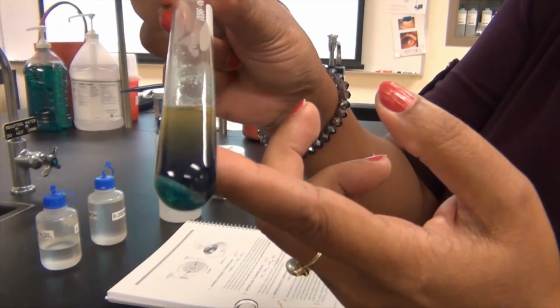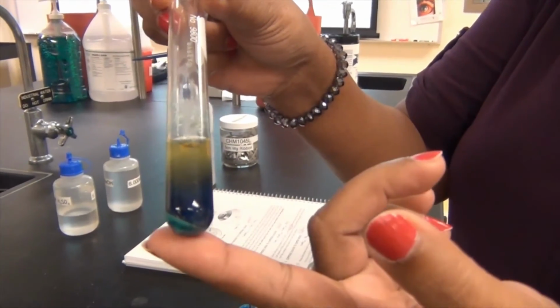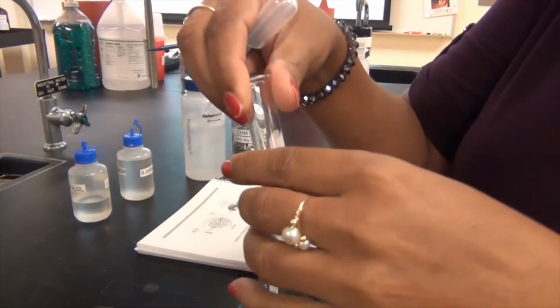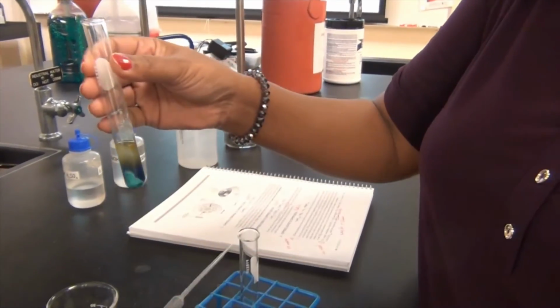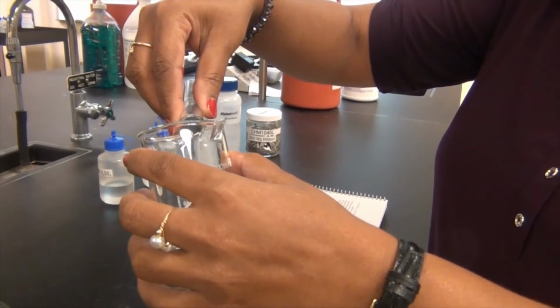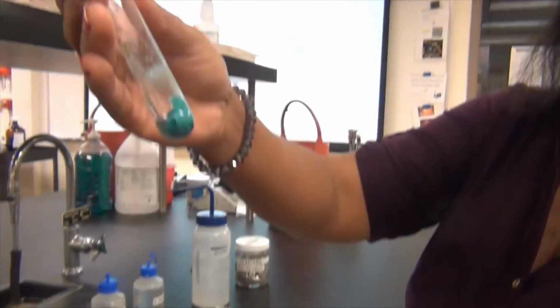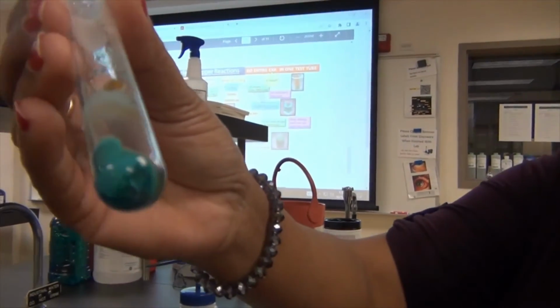And I'm supposed to decant the top part. So decanting means just leaving the solid behind and getting the liquid out, okay? So I'm going to go ahead and pour that out in a beaker. And there's that. So this is what I'm left behind with, okay?